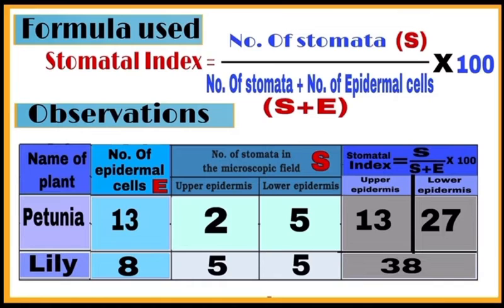and finally calculate stomatal index by putting values of S and E and write the value in the last column.